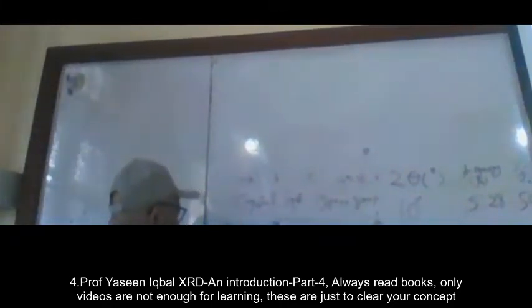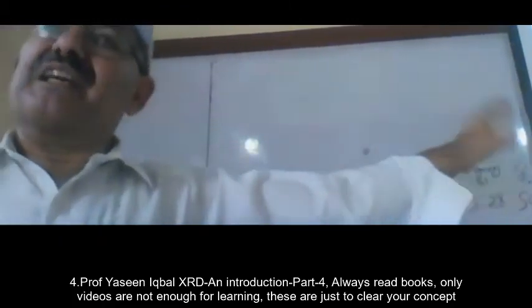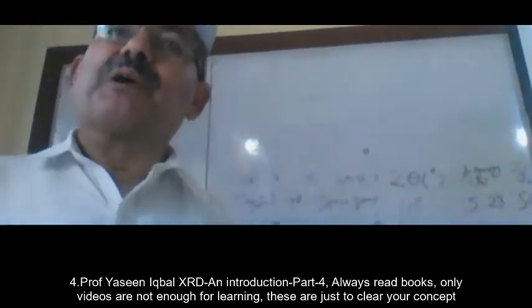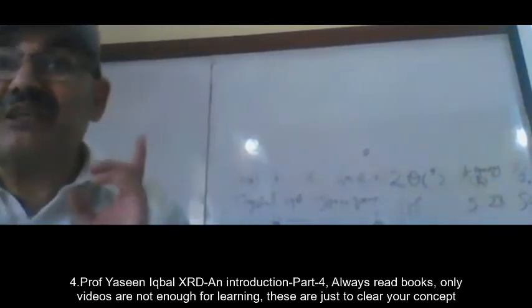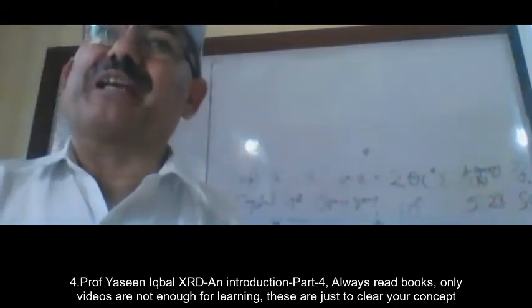Okay, another important point: if all the peaks and the relative corresponding intensities match with the ICDD or JCPDS card you are comparing it with, well and good, your data is done. But at the same time, you need references to support your data. If a reference is not there, then you must recheck again and again, because then you are the first to report that. And the first reporter must be very, very careful.